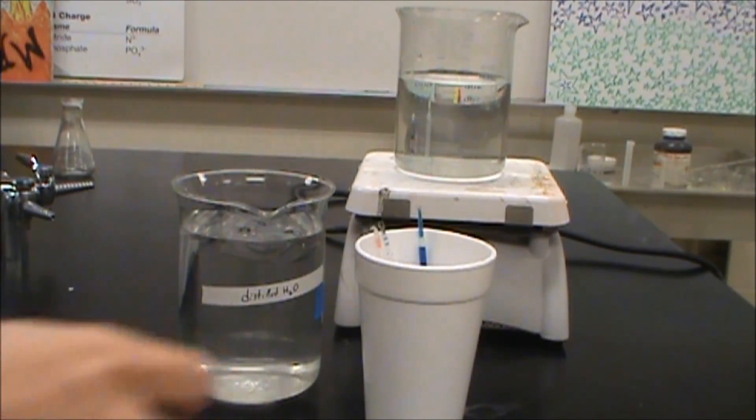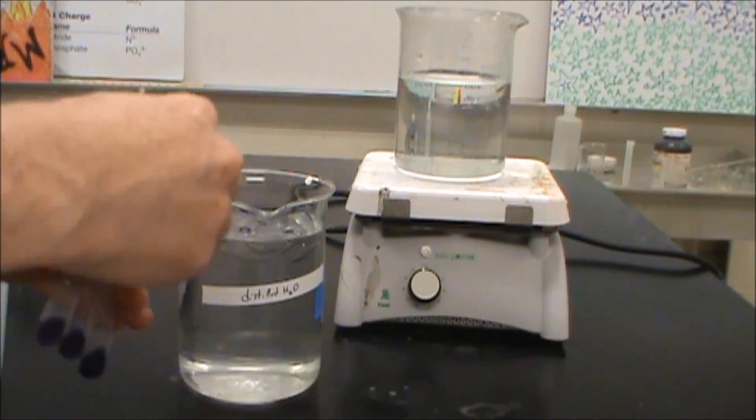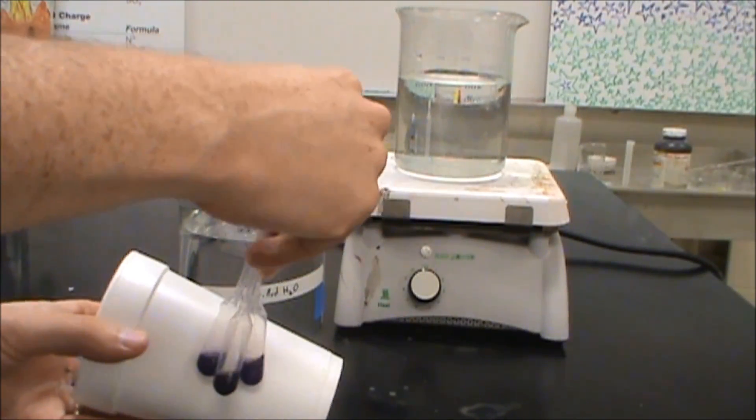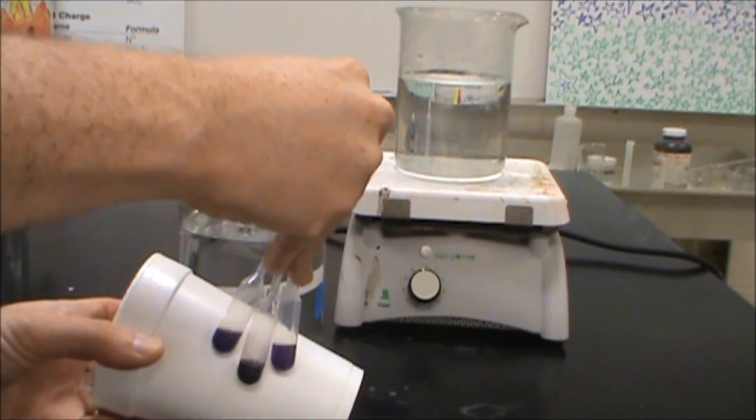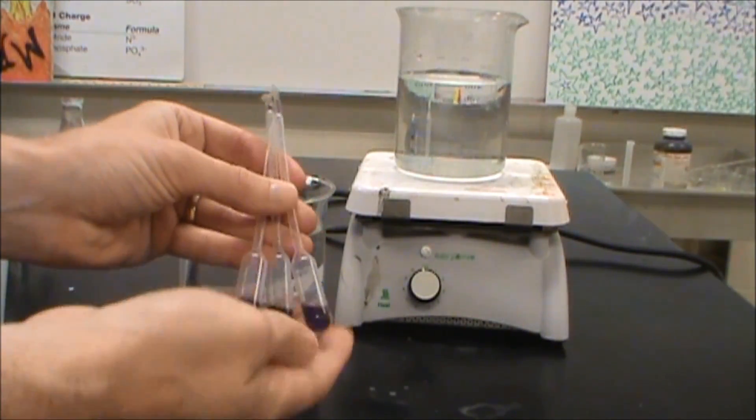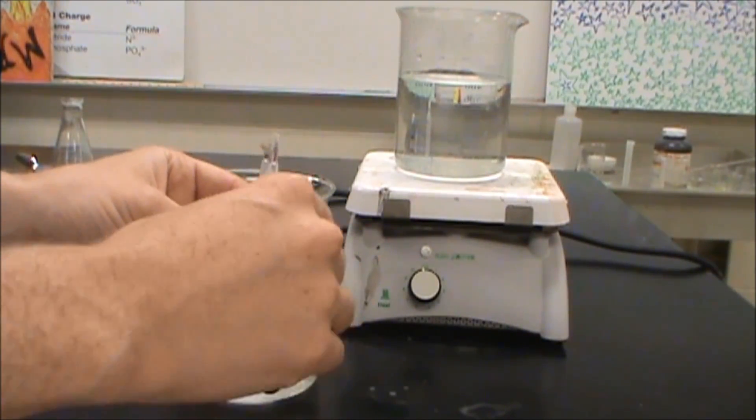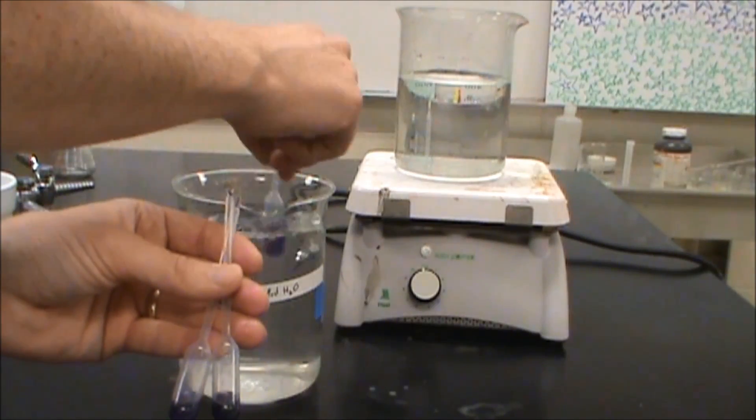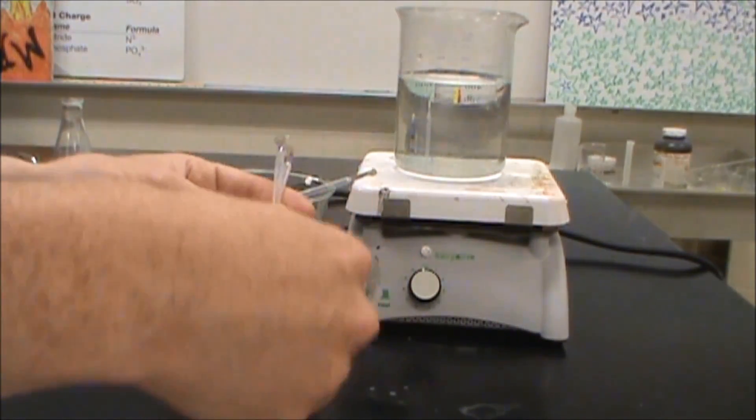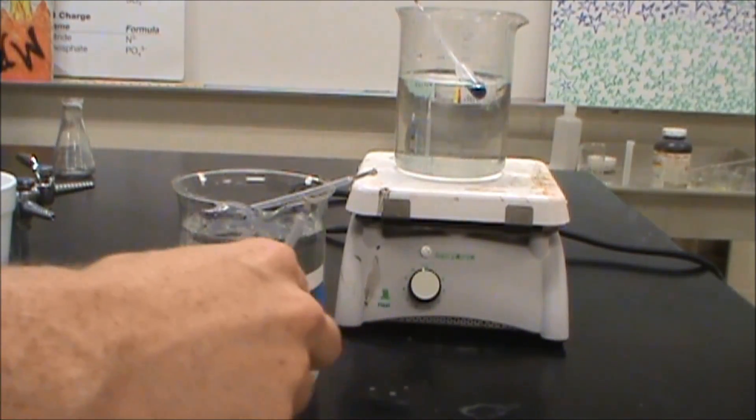So for the final two we're going to change the temperature. I've got three purple cobalt chloride complex mixtures, or cobalt water complex mixtures. And what I'm going to do is I'm going to keep one, I'm going to put one into ice water, and I'm going to put the other one into very warm water.